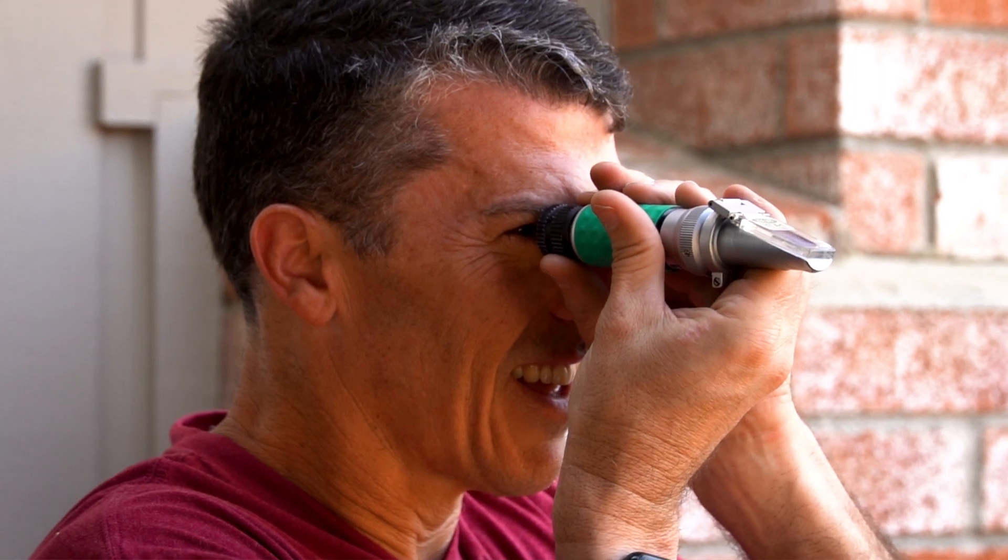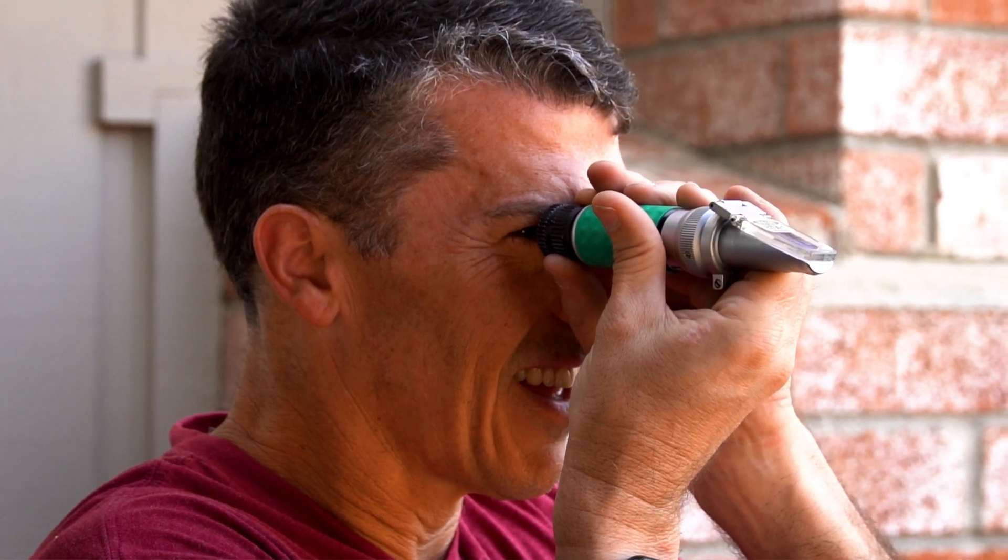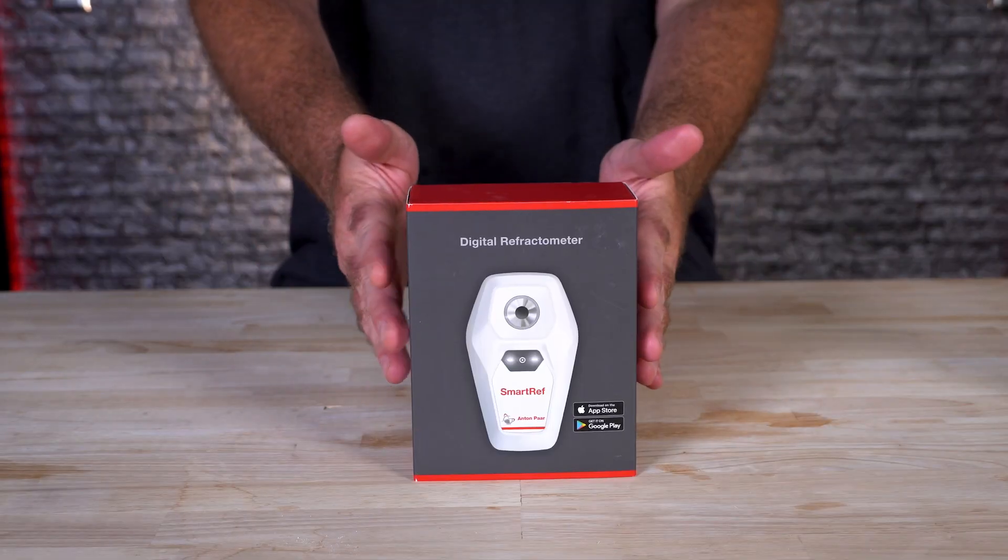If you're an all-grain brewer, you probably already have a refractometer. It's a big part of your tools for taking measurements on the hot side of brewing — your mash, your sparge, during your boil. It's an easy, quick way to take measurements to see where your gravity is going and to make sure you don't over sparge.